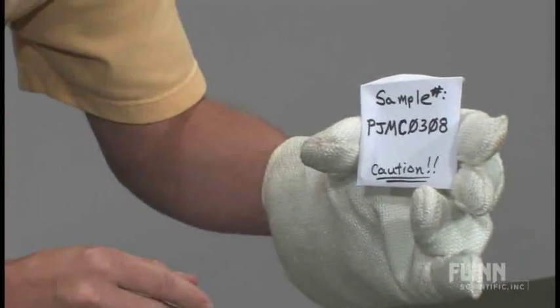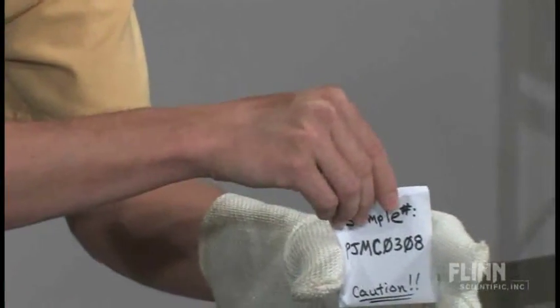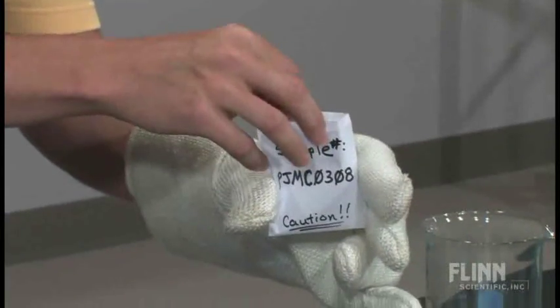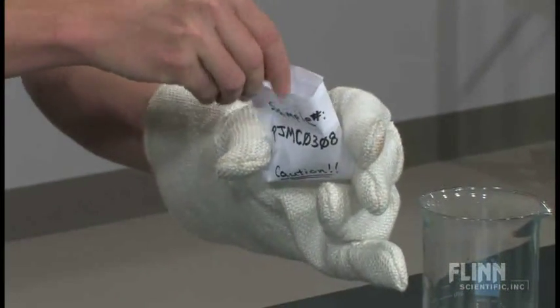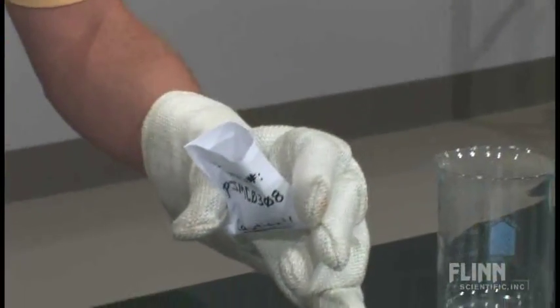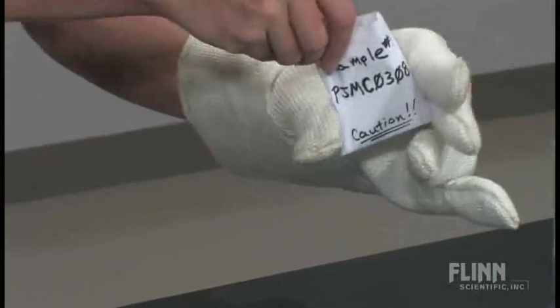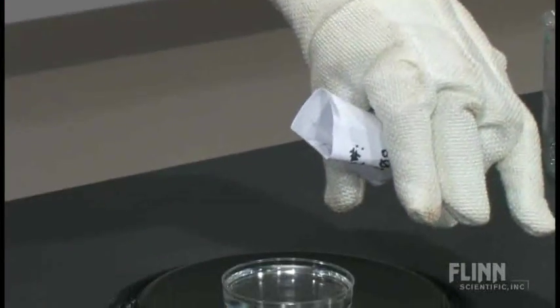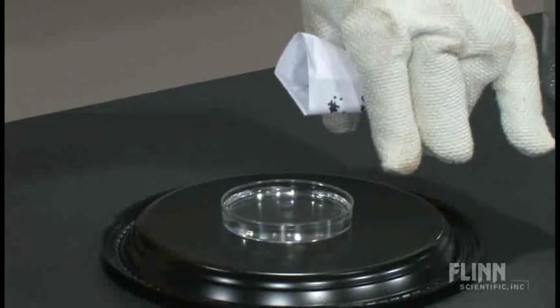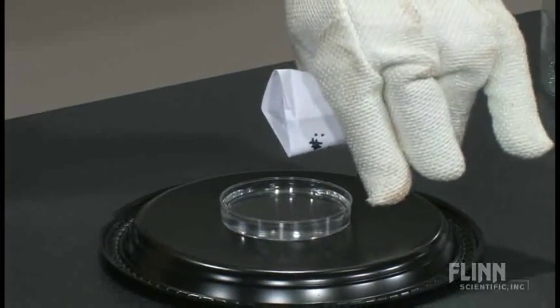Sample PJMC-0308 being put into a Petri dish. It has some water in it. I hope we're okay. It looks like a white crystal, but I don't know. We'll give it a little shot here and see.